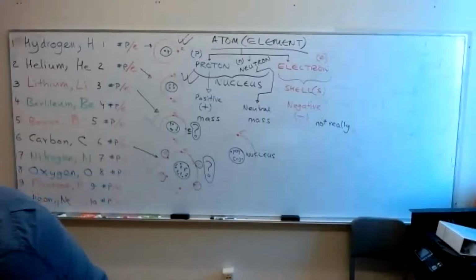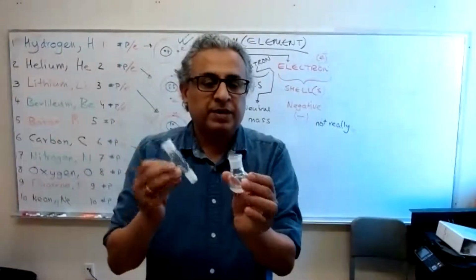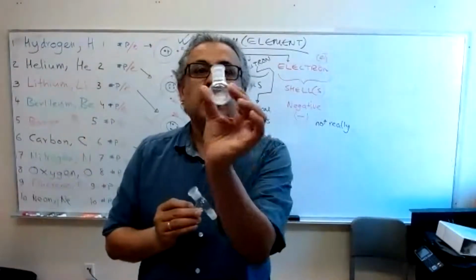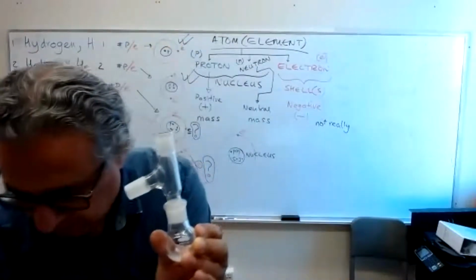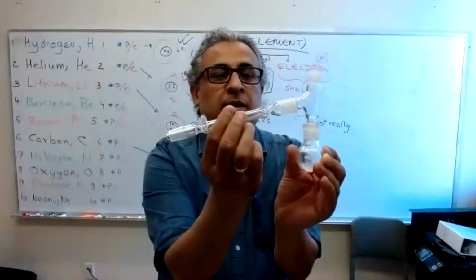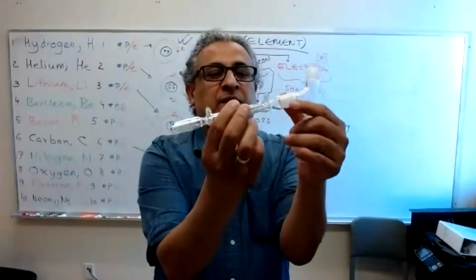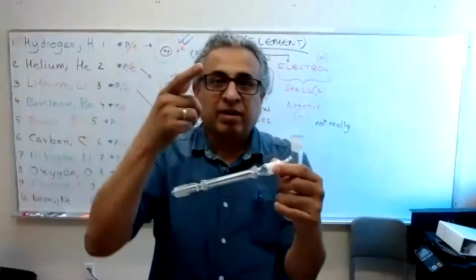I'm going to use a different one. Okay. I'm using a different setup because I was missing the condenser. Round bottom flask. Someone said condenser. What's this? You can correct yourself.